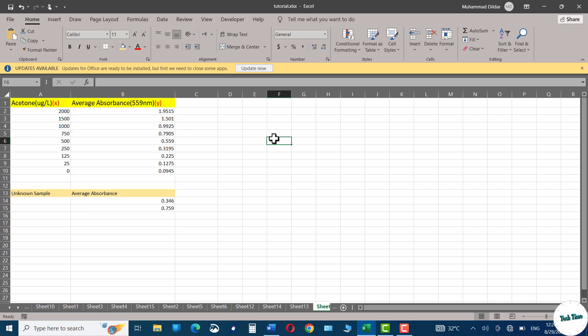Hello everyone. In today's tutorial, I'm going to show you how to create a linear standard curve in Microsoft Excel.